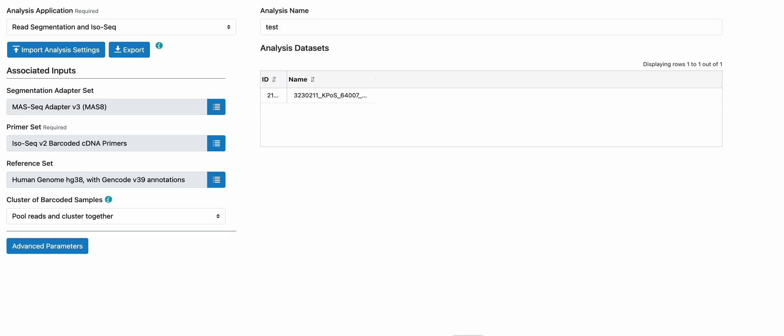This is a demo for the resegmentation and ISO-SEC analysis workflow supporting the Kinex full-length RNA kit to be used in conjunction with the ISO-SEC Express 2.0 kit in SmartLink 13.0 and up.